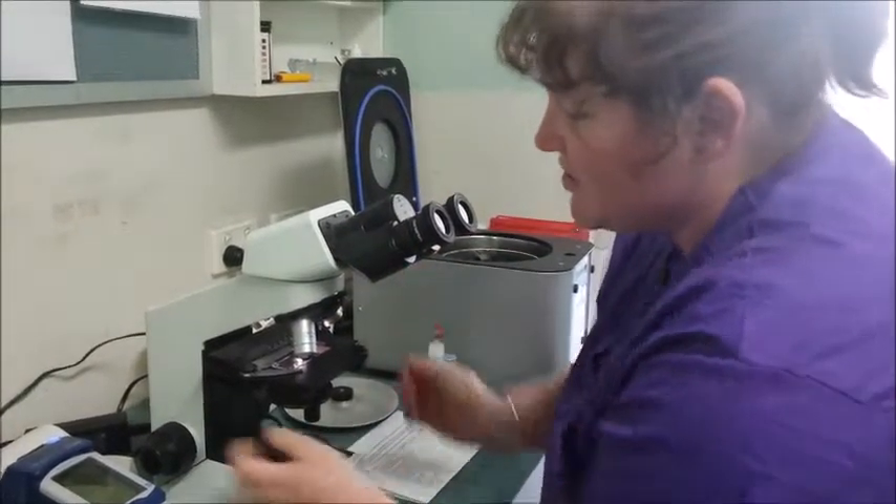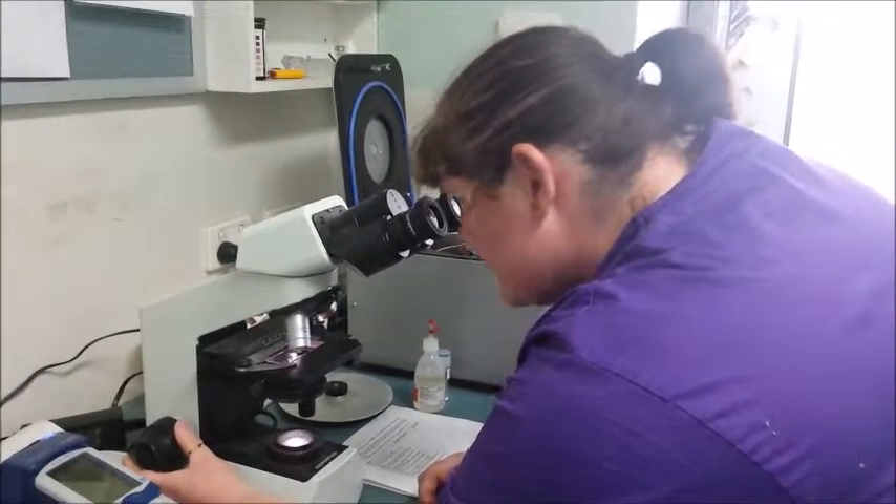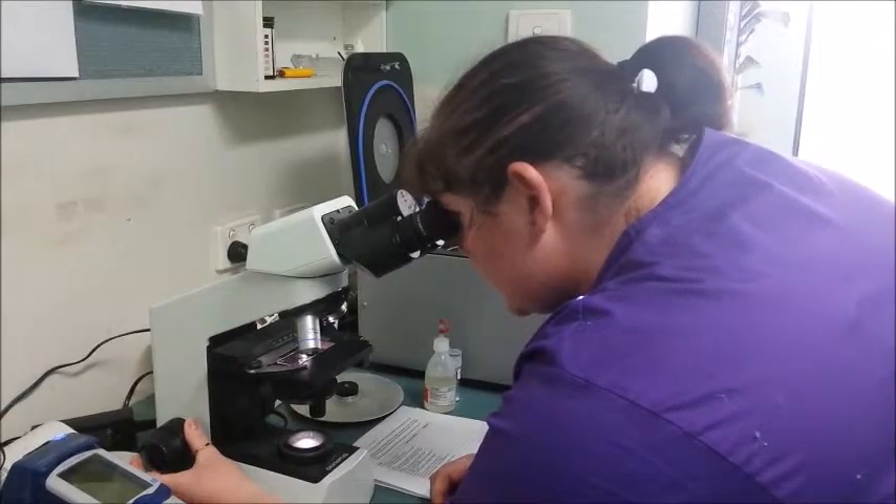Once you have a single field of vision, use the coarse focus and get a clear image.